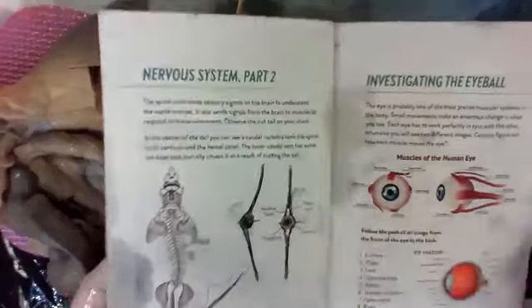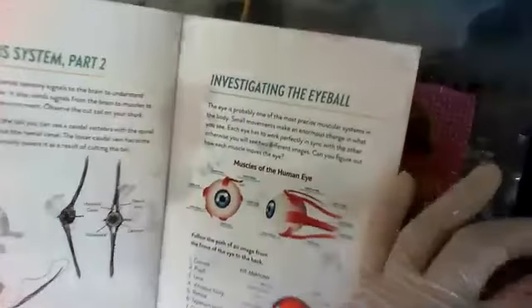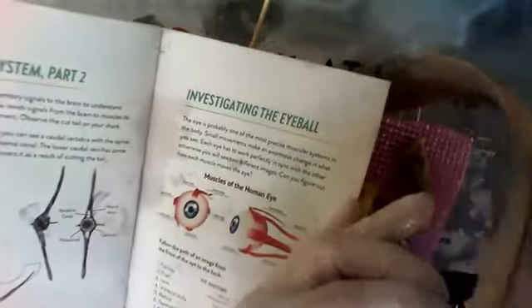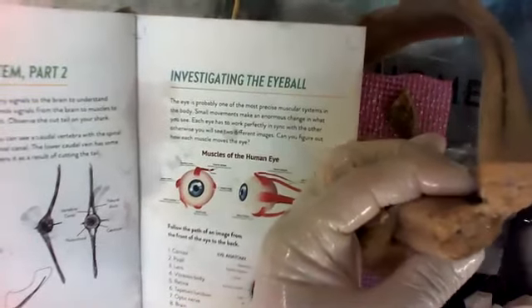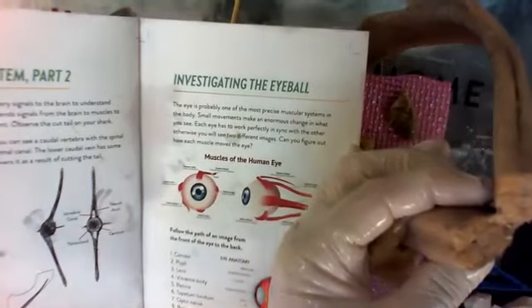So you can go through and plug them in if you want. And the last part, let's take an eyeball out. So we're going to take an eyeball out and get access to the brain. So the nervous system, we saw the spinal cord, we saw some of the bones. Here you can see where it cut. They cut this so that the blood will come out and it doesn't sit in there and cause problems.